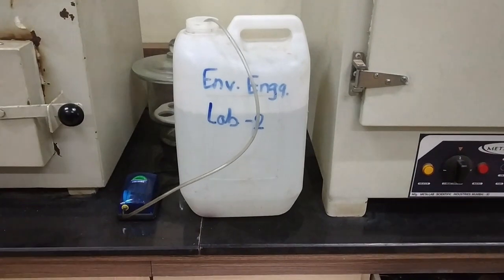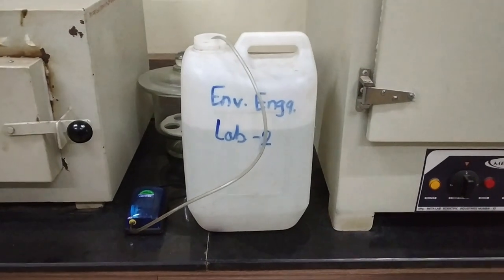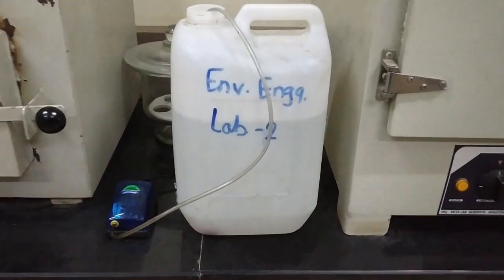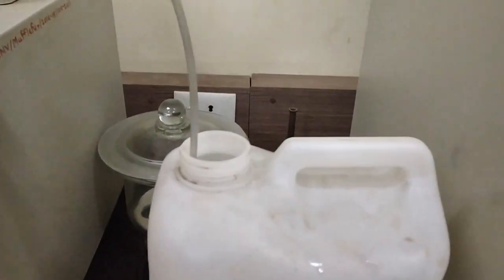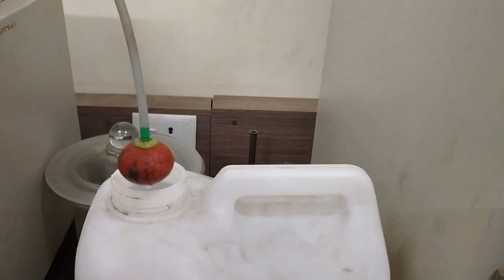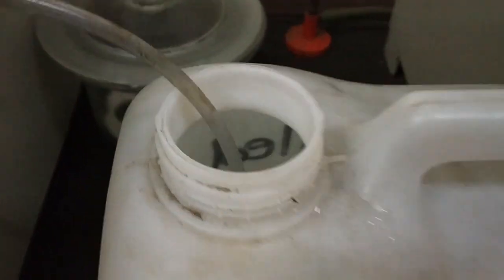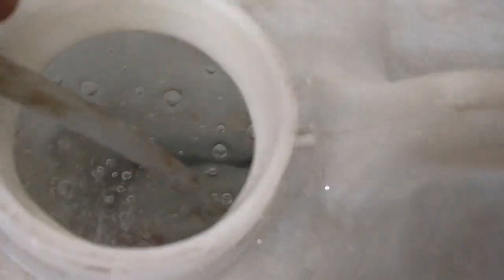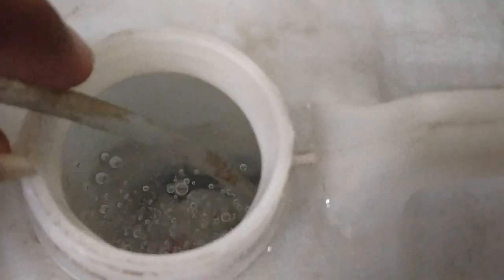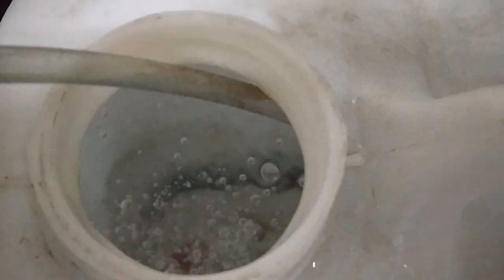the current temperature. So here you can see we have a fish aerator. The blue colored equipment is nothing but a fish aerator, and with the help of this particular fish aerator and this type of nozzle, we are going to add the DO. Here you can also see the bubbles coming out because of the air addition, and that is nothing but the DO increase for this distilled water.